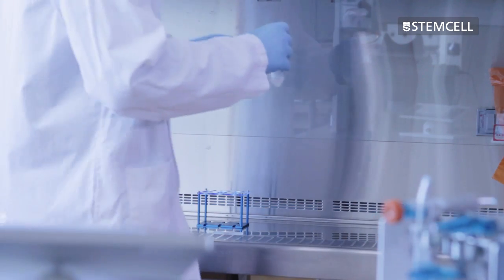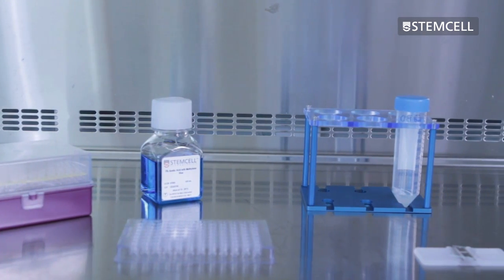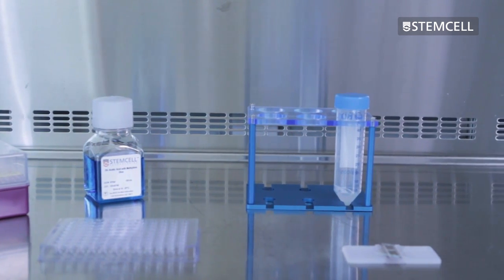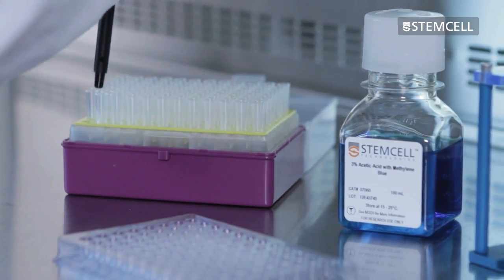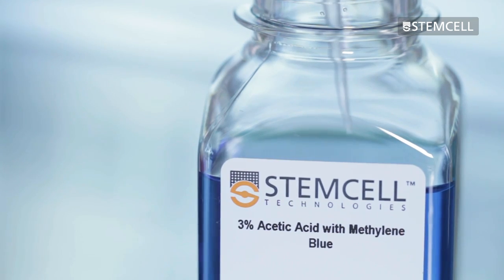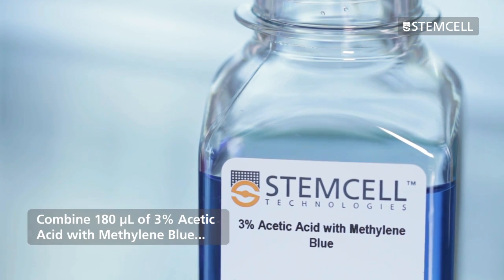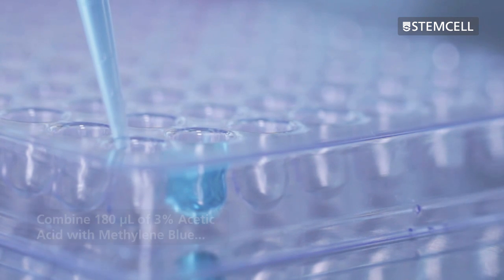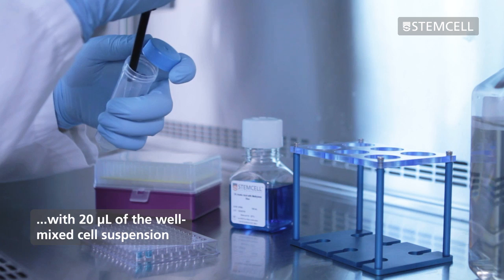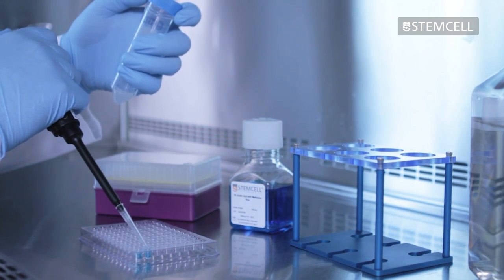For accurate cell counting, the stained suspension should contain 50 to 100 cells per large square or quadrant in the hemocytometer. The appropriate dilution factor will depend on the approximate number of cells present in the starting sample. When working with PBMCs, we recommend first starting with a 10-fold dilution by combining 180 microliters of 3% acetic acid with methylene blue with 20 microliters of the well-mixed single cell suspension. Depending on the cell concentration, further dilution may be necessary.